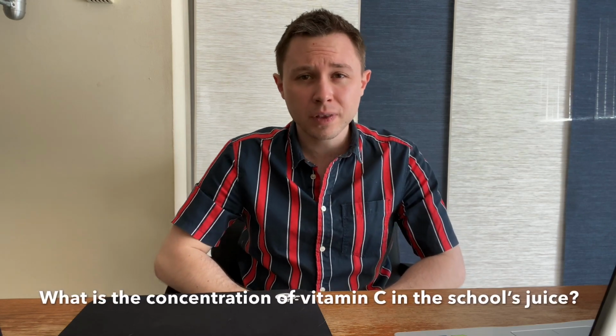Right before we left school, we were asking the question, what's the concentration of vitamin C in the school's juice? And a lot of you on that day were nice enough to actually donate your juice from lunch, and I have it right here. I took it home with me. And this week, we're going to go ahead and proceed with that experiment. Let's take a look at the juice.